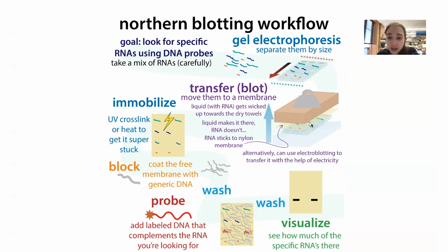So you take your gel and you put your membrane on top, and then you put a bunch of paper towels and some sort of weight. What's going to happen is that through capillary action, the same reason that when your paper towel gets wet the water wicks up, the water is going to want to wick up through these paper towels.